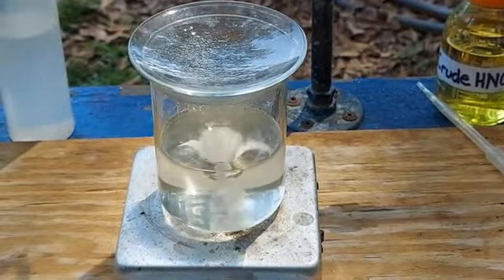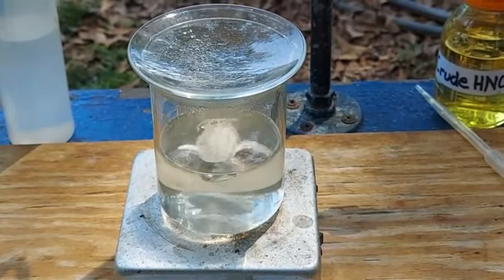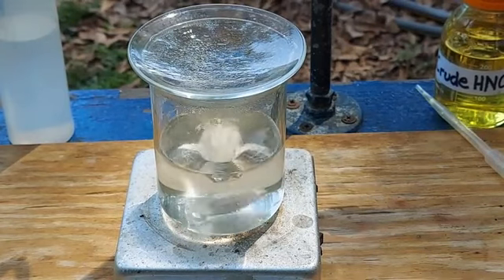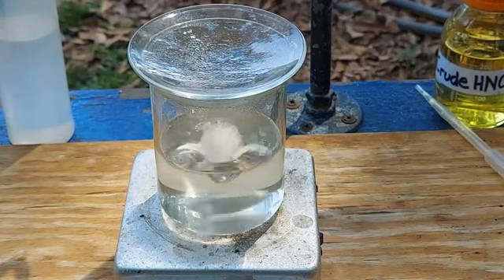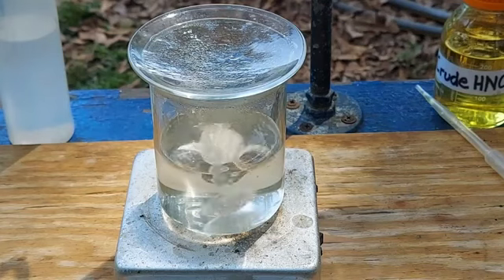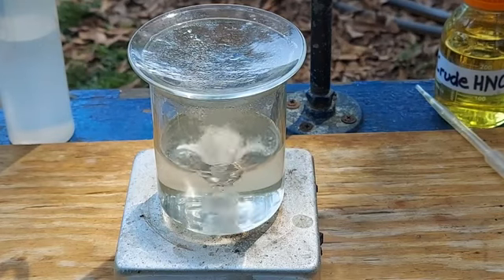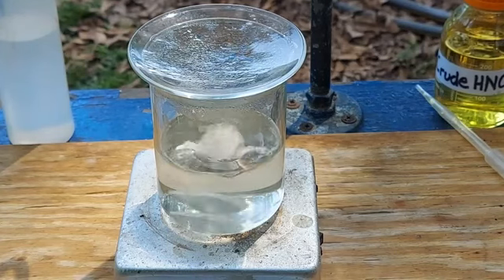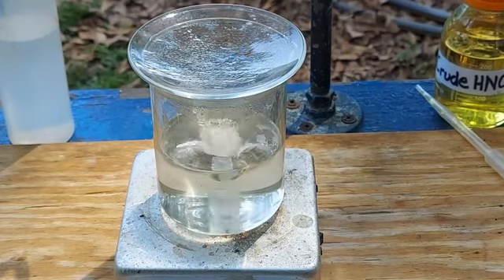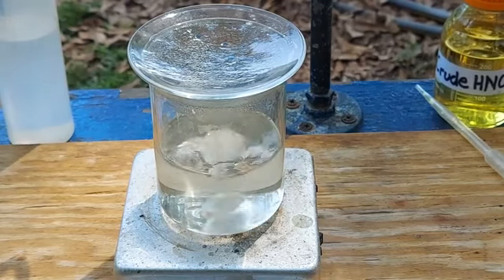Okay, addition of about 3 or 4 more mils of the nitric acid. And letting this stir for about another 2 or 3 minutes has given us a completely clarified solution where all of the mercuric oxide, and I think it produced the mercurous nitrate as a white precipitate when I first started adding in the nitric acid. This is not unexpected. But all of that has gone into solution, and now everything is in there as mercuric nitrate.